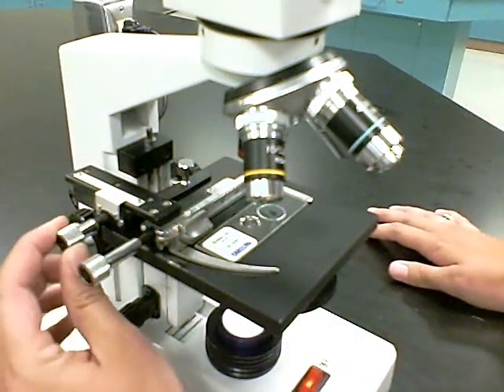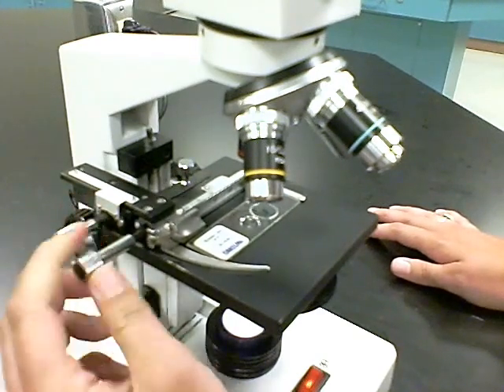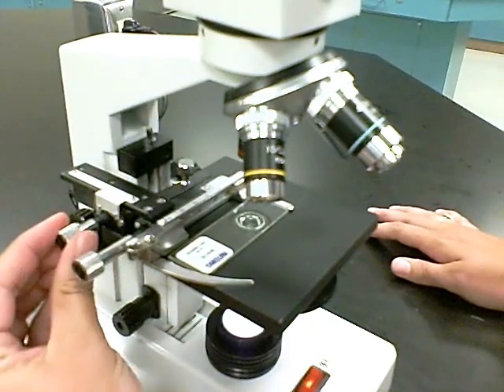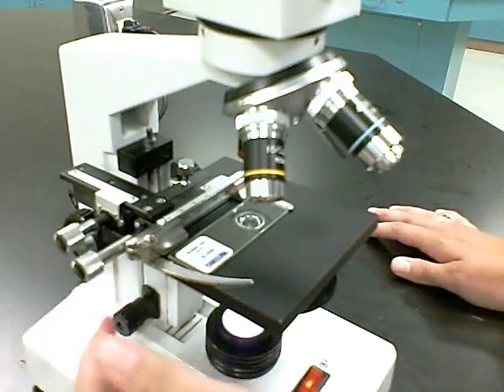And this mechanical stage is handy. You can actually move your slide up and down and side to side with this mechanical stage. So you can bring your specimen into the field of view and move it up and down and side to side.